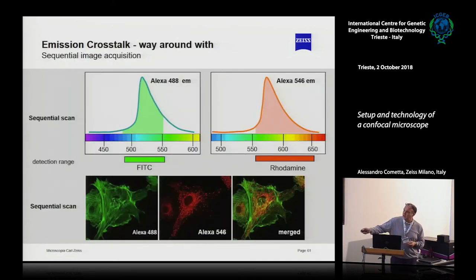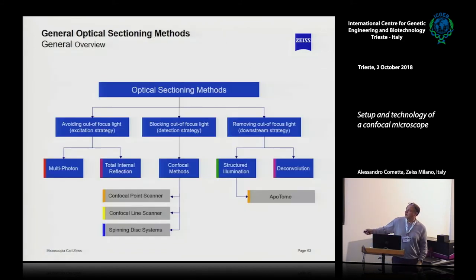So in this case, this is what I have in the results: a clear red, a clear green, a clear red, and there is no overlap of the two systems. Okay, there is some overlapping here, but it's a physical one. I can also do something different because I'm not restricted to here, but I can enlarge and have a much more efficient system, keeping also 10% or 20% or 30% of the light. This is true for every confocal microscope.